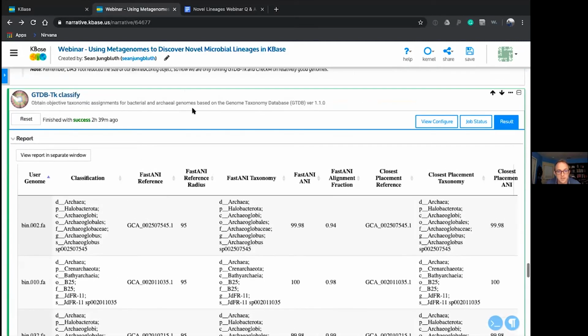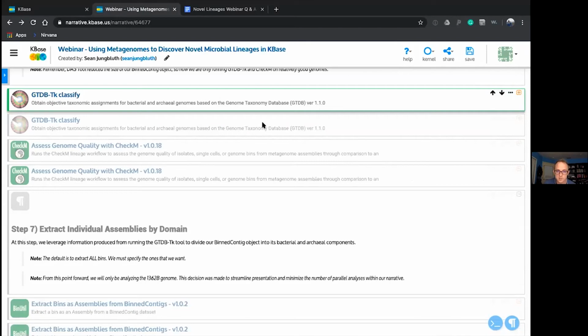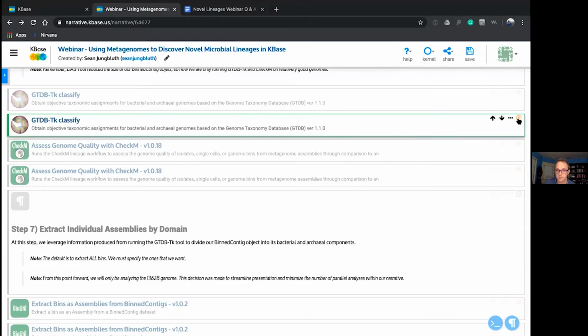In these particular samples compared to most samples, it's unlikely that you are working in an environment that's quite as inaccessible as the deep subseafloor rock. So you may not get as many new lineages, but it's likely that through using tools like this and leveraging them in the right way, you can explore novelty in your samples in ways that were not previously accessible.